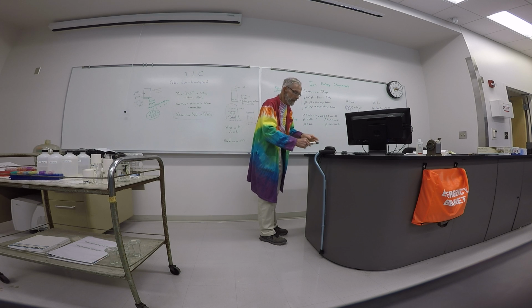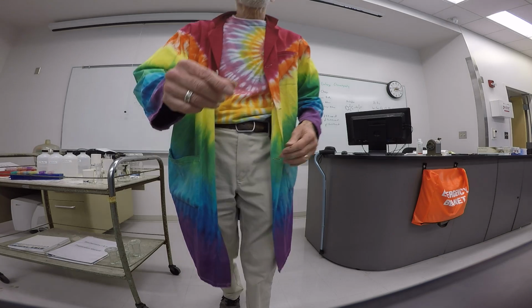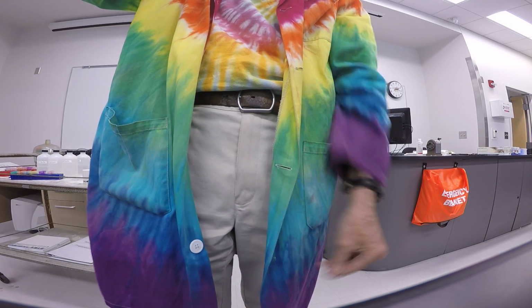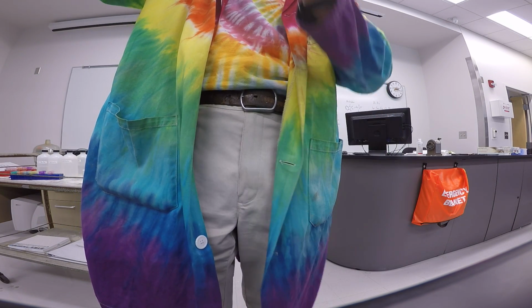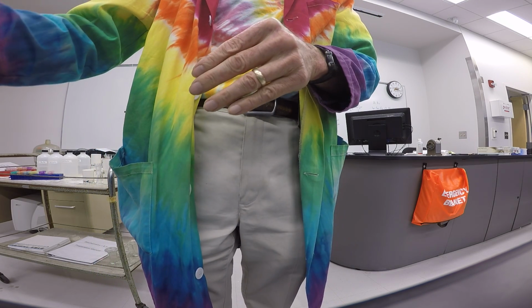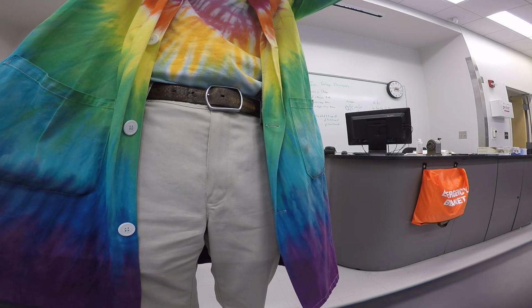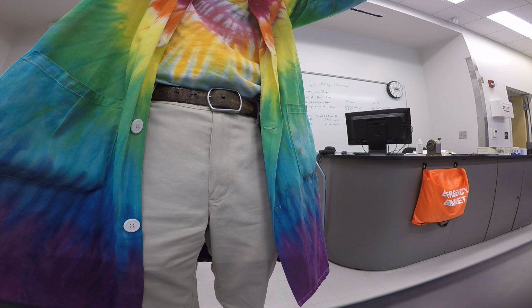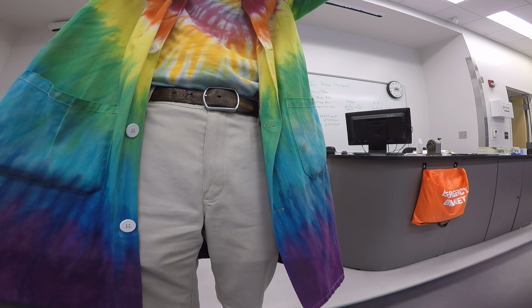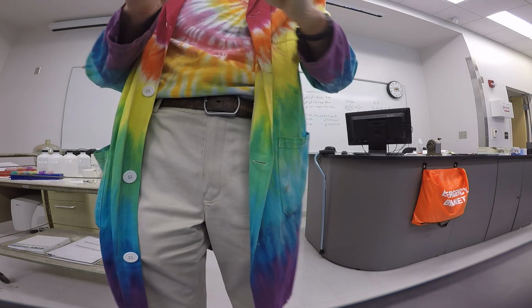Now in this one, technique is a little bit different. First thing you can do when you start your column is simply take off the bottom and let it drip. If it doesn't start dripping right away, oh, this one is very nice, it dripped right away. Give it a little tap like that, and it should start dripping. When the liquid is right down, the water is just right at the top, you can't even see the meniscus, then you close it up and you put on your mixture of amino acids, your unknown.